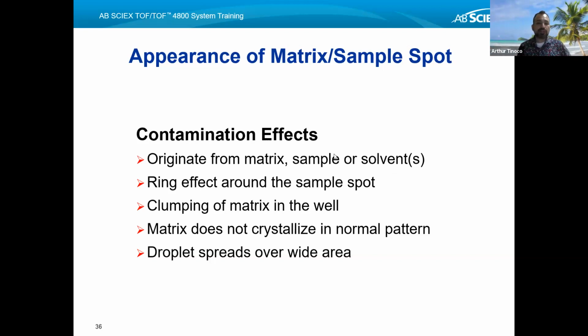The next source of contamination may be the samples themselves, right? Because we were preparing samples not necessarily in solvents that are the highest grade. That's okay, as long as we know what ingredients we're putting into these solvents. This is very important when you're considering that the technique is based on the measurement of ions. One of the things you definitely do not want to include, or not include much of, is external salts, because salts can definitely give you a very high signal, as they are made of ions.